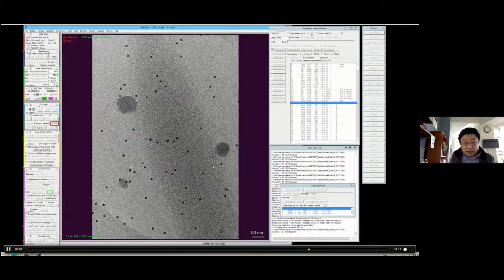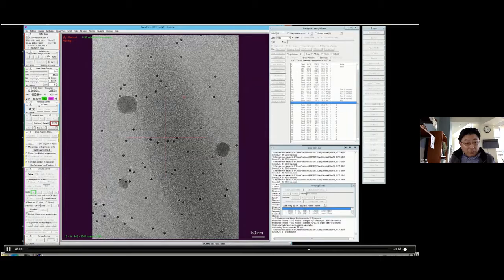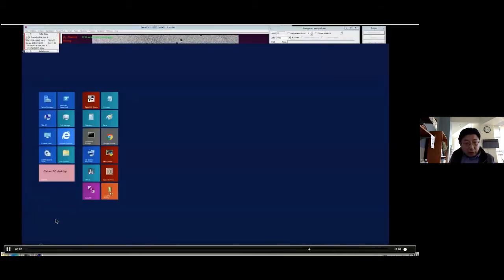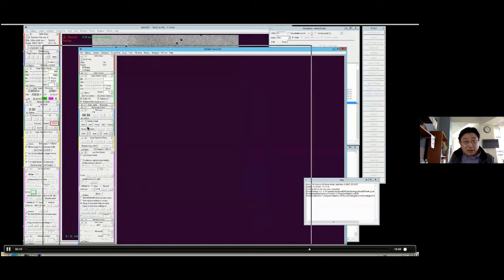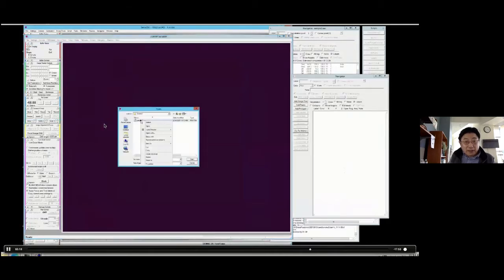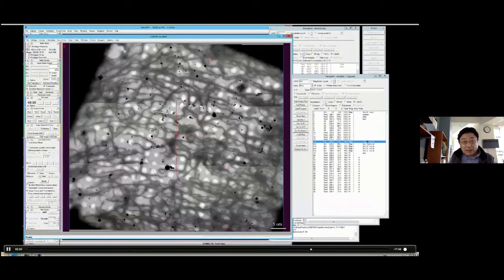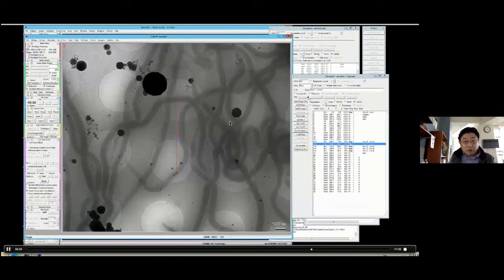What you can see is that now we go to this so-called dummy. Basically, dummy lets you operate in parallel. You take the same navigator file, make a copy, and paste it. We have a so-called paste option. You can see everything we saw previously is there, and then we can add more targets. We can go and select more.